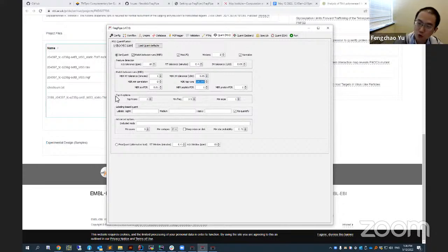There are two ways to calculate protein intensities. So first way is top N approaches. Another way is the max LFQ approaches. For our experiment, max LFQ is always better than top N. But if you only have 1 or 2 experiments, then LFQ will have a lot of missing values due to the algorithm of max LFQ. So you might need to use top N.